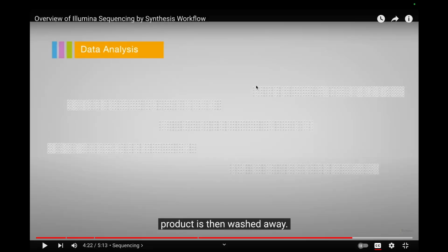in the first step. That is important because when you come to the analysis of these reads, this is where you can use those indices to identify which part of your original genome the reads came from. So yeah.